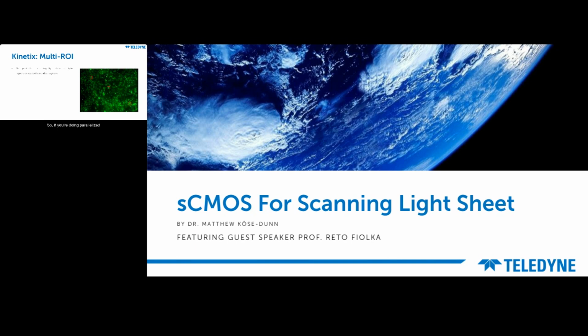And one of the modes we've implemented relatively recently is multi-ROI. So if you're doing parallelized scanning light sheet, such as parallelized DSLM, as Professor Fiolka mentioned, having multiple regions of the camera that can read out are advantageous. So you may want to image at high speeds, but not across the entire sensor. If you have this image on the right here, you may want to image just the areas those 3 red squares are. If you just establish one region around them, you'd have to read all the way through it. If you can establish multiple regions, you can image these areas at higher speeds. And this is what's known as multi-ROI.